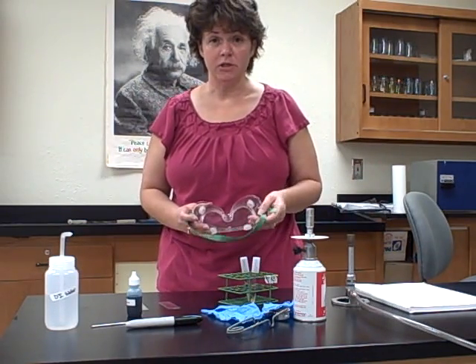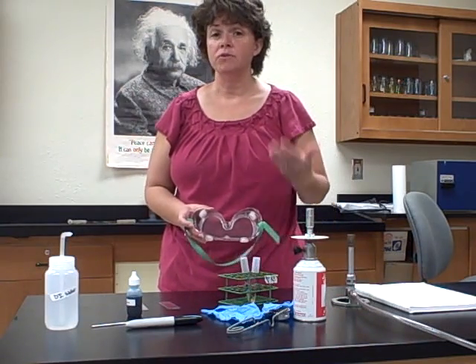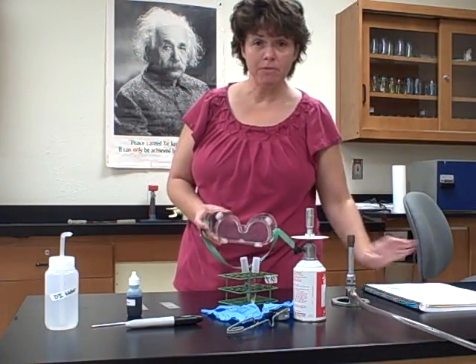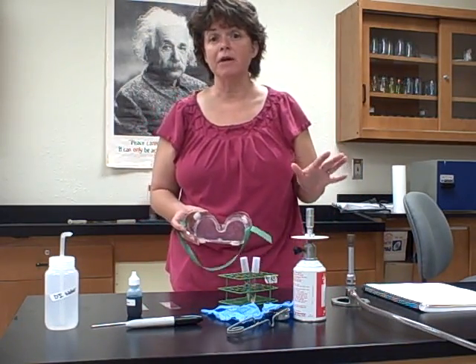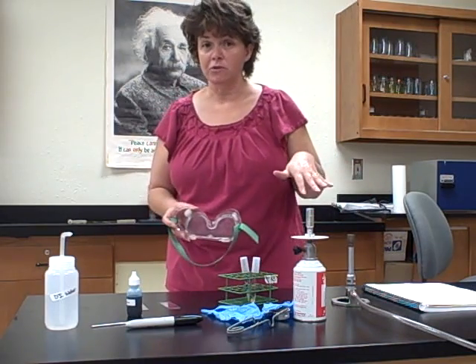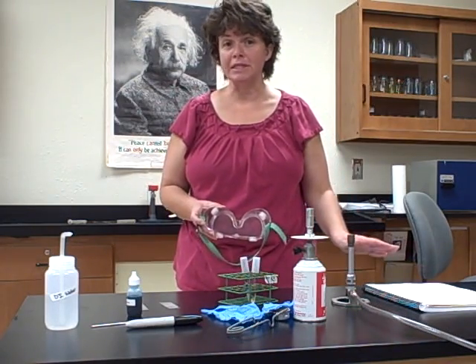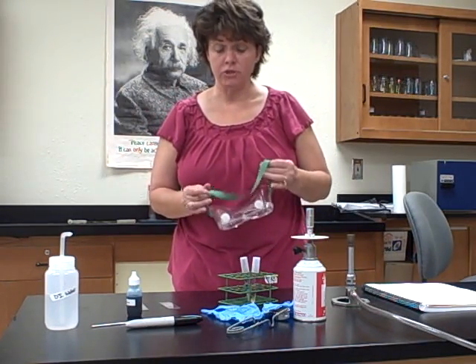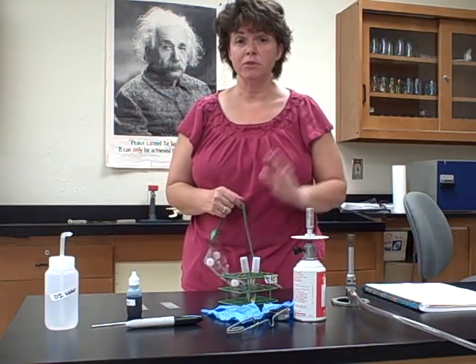Before I get started, one thing to mention: in your lab manual, when they have a procedure, they tell you how to do it and give you pictures on page 27 for this particular lab. You'll notice I have only the supplies I need on my lab table — my lab manual, a pencil, and the supplies for this lab. There's always a list of supplies at the beginning so you know what to get from the cart.